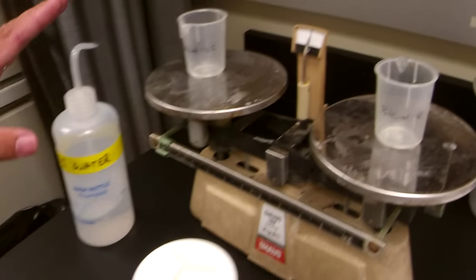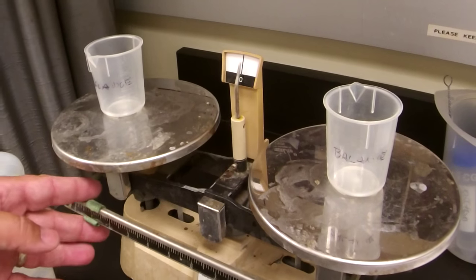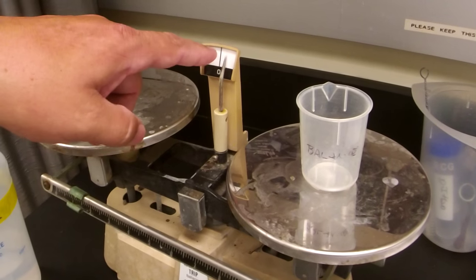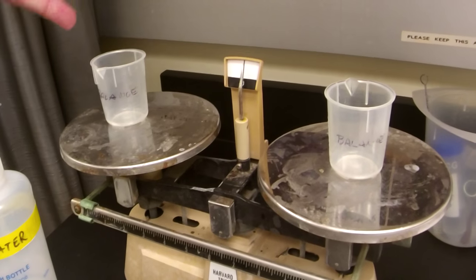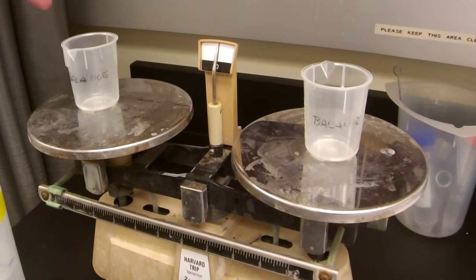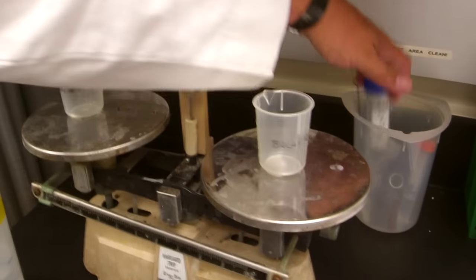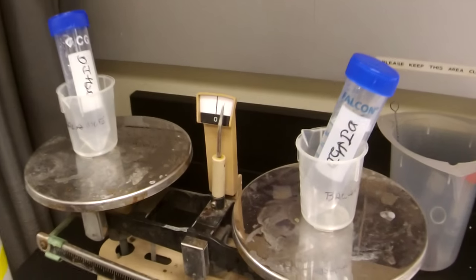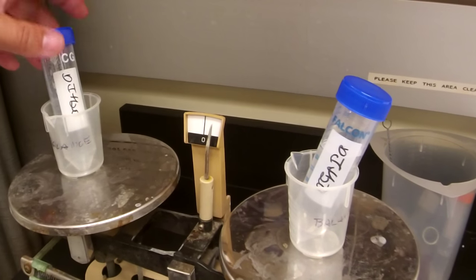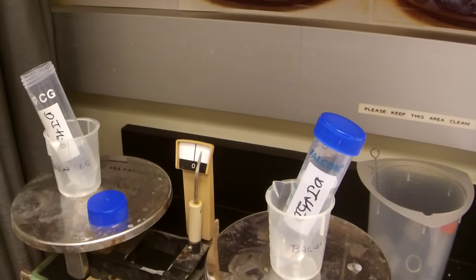Now let's talk about how to balance the tube. We have a balance here set to the neutral point. If it's off, adjust it until it reaches neutral — and you have to be patient. We have two tube holders here. Notice that you have to balance while the holders are on, as they may not be the exact same weight. For most cases, put your tubes on the holders and adjust with whatever solution you're centrifuging until the volume is the same. Always make sure the cap is on when you're doing your balance.